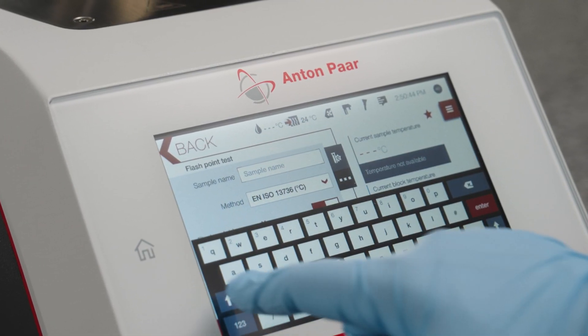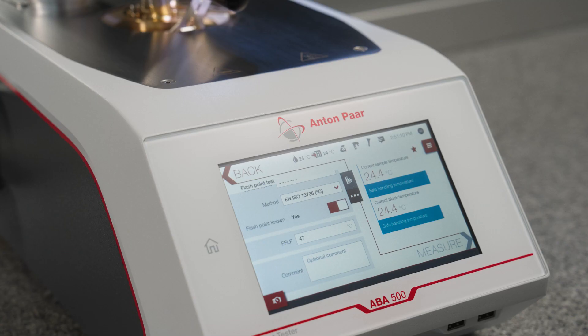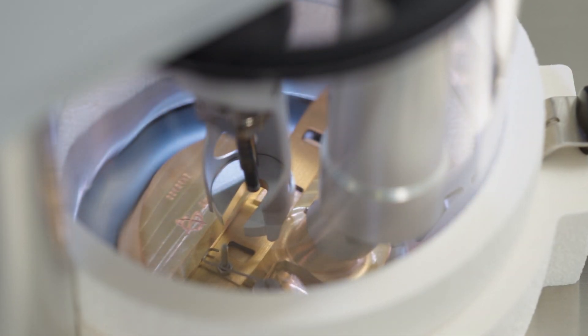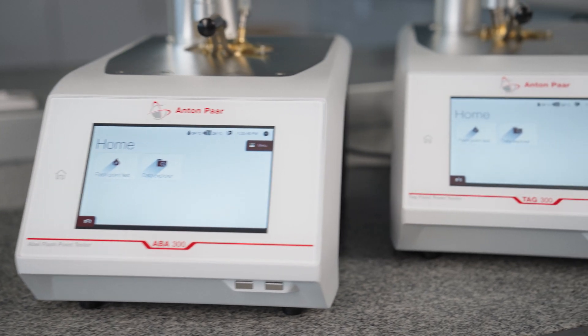The graphical user interface is intuitive, like a smartphone. The fail-safe two-sensor fire extinguisher system increases safety tenfold.